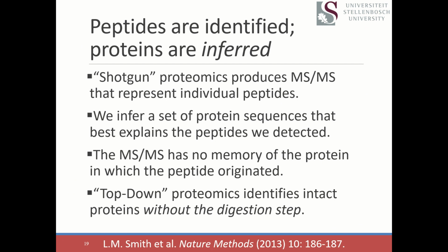All right, now that I've given myself only 5 minutes to finish here, I'm going to start by saying, if you're really interested in whole protein identification, understanding which PTMs are appearing in concert with each other, you really need to be doing top-down proteomics. Because the stage of moving from a bunch of peptide identifications to protein identifications is one of inference. If you have a phosphorylation on this peptide over here and a phosphorylation on that peptide over there, and they happen to match to the same accession protein in the database, you still have no guarantee that these two modifications exist on the same protein structure. So you hear what I'm saying with that?